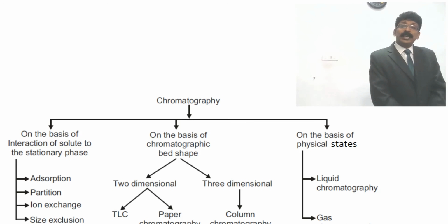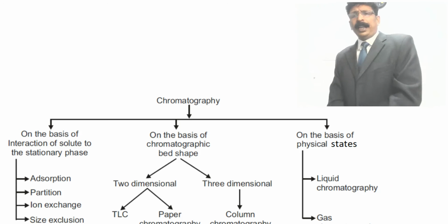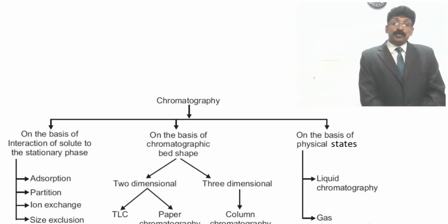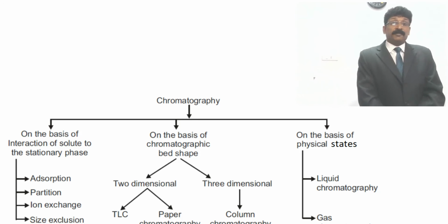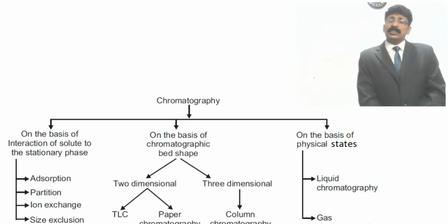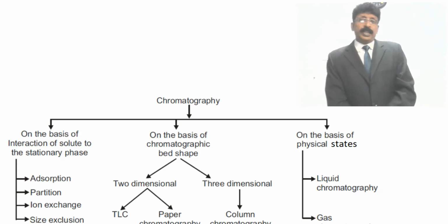So we can see liquid chromatography, which works in partition chromatography, and liquid and solid, which is adsorption chromatography. There is pure liquid chromatography and also gas chromatography. There is also gas-solid chromatography, and solid-liquid chromatographies.